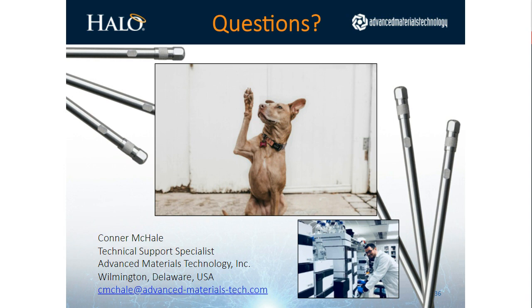Yeah, that works. I know we use a lot of Shimadzu instrumentation here at the lab, and there's a purge and rinse setting on the door. Typically, if I'm running a new application or I haven't run on the system for a while, I'll just quickly do this rinse and purge while I'm doing my sample prep. And it'll clean the needle and clean out the auto sampler automatically.